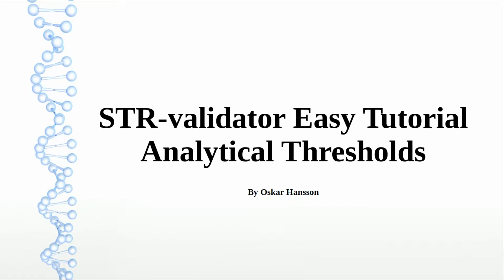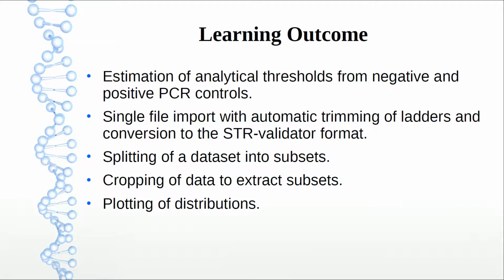So welcome to the tutorial on how to estimate analytical thresholds. In this tutorial, you will learn estimation of analytical thresholds from negative and positive PCR controls, single file import with automatic trimming of ladders and conversion to the STR-validator format, splitting of a dataset into subsets, cropping of data to extract subsets, and plotting of distributions.